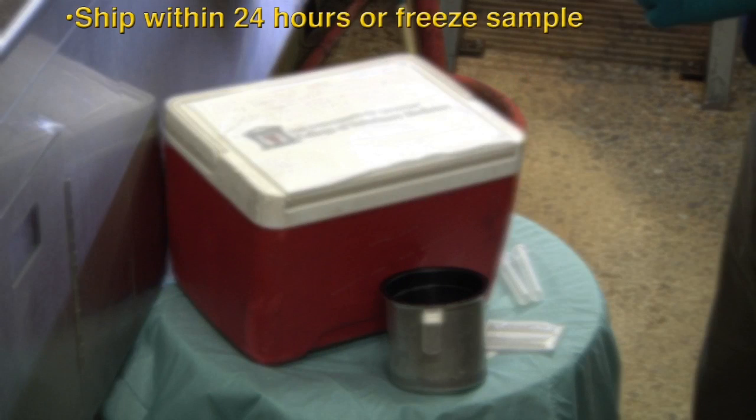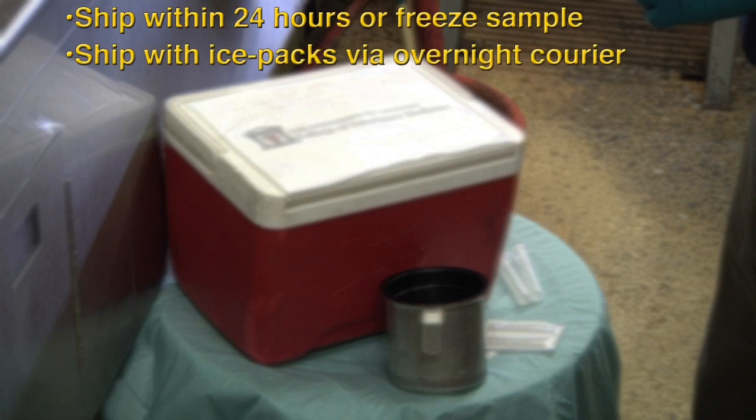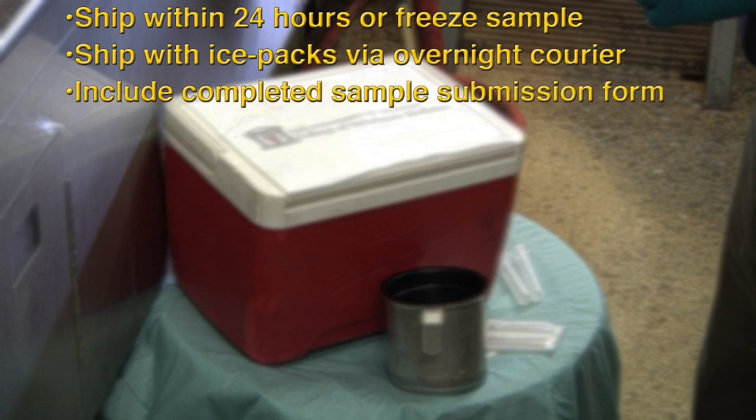Close the sample tube and place it immediately in the cooler. If the sample will not be shipped to the lab for culturing within 24 hours, it should be frozen until it is shipped. Milk samples should be shipped in a cooler with ice packs by overnight courier. Be sure to include a completed sample submission form with the samples.